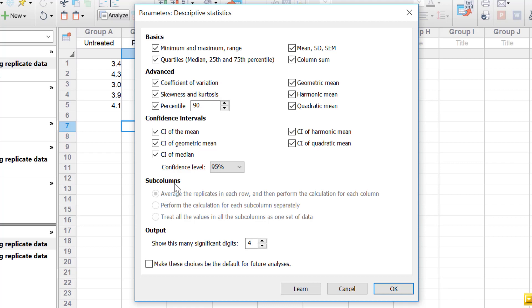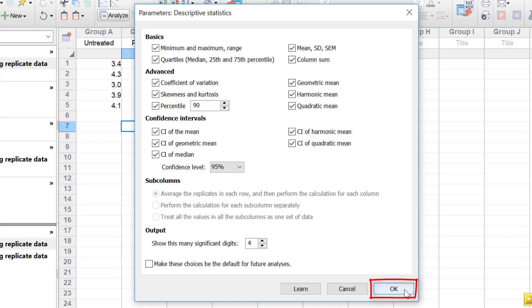If I had a subcolumn sheet, these options would become active and you can decide whether to perform the calculation for each subcolumn separately or treat all values in the subcolumns as one set of data. Because I've got a column type of sheet, this is not available. Finally, there is an option to change how many significant digits you want the data returned — currently four digits. You can also check a box to save these selections for future use. For now, I'm going to click OK to return the descriptive statistics.